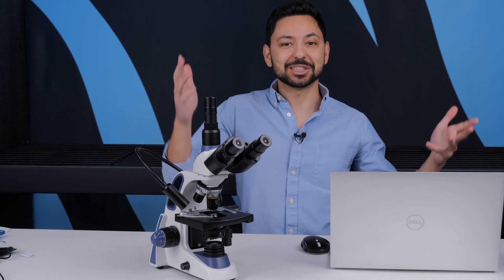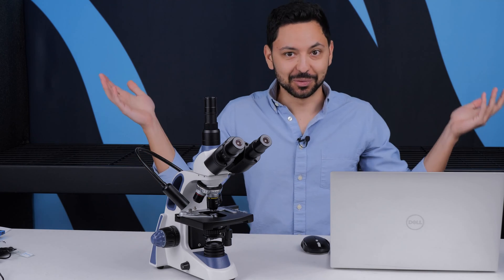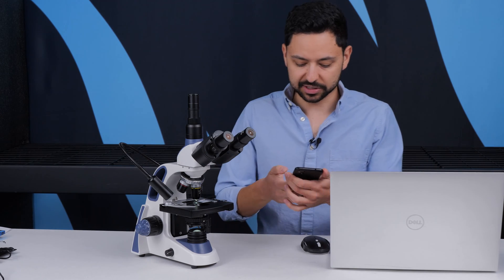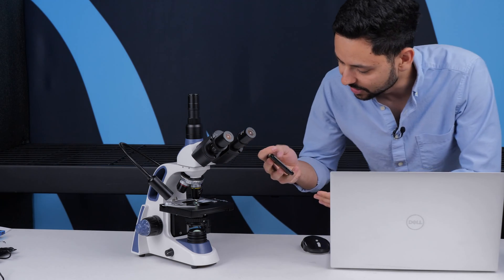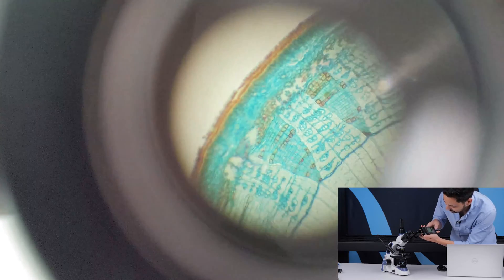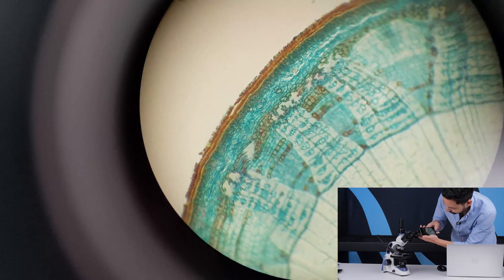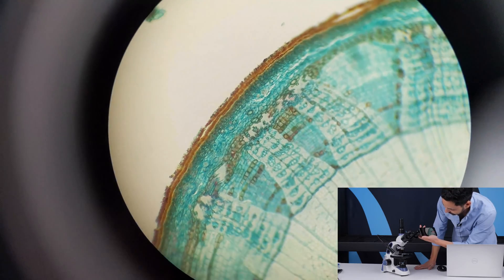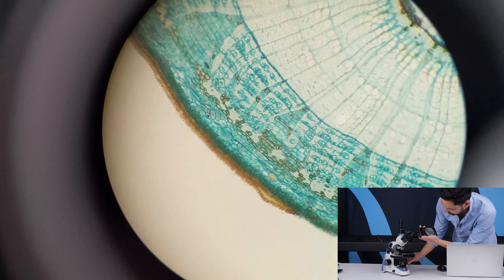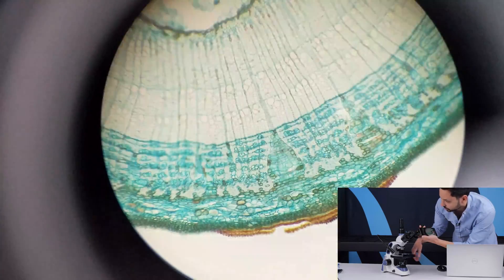You might say, just use your smartphone and put it right up against the eyepiece — that'll take some great photos, right? Well, let's try it out. This is at the 10x objective with 10x eyepieces, so this is 100 times magnification. Okay, it's not bad — you kind of have to hold it on there nice and tight otherwise the image will shake around. Yeah, this works okay, especially with the 10x eyepieces it tends to work a lot better.